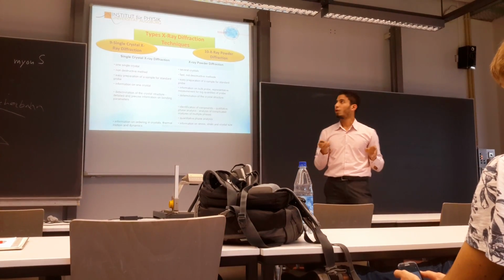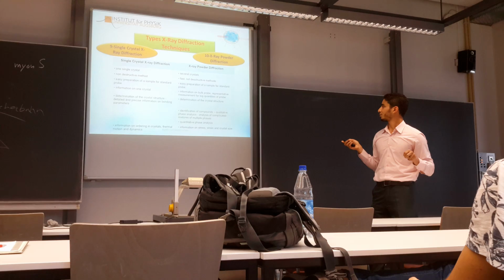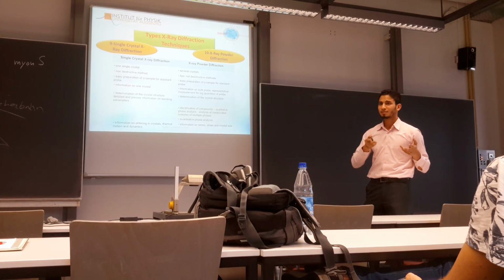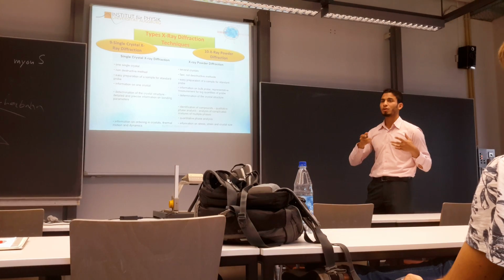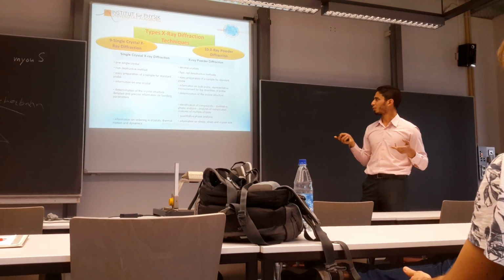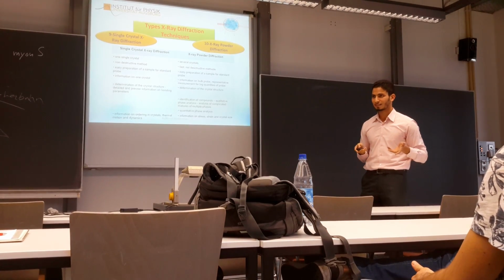Now we are going to shift to two types of X-ray diffraction techniques. There are two main types: single crystal X-ray diffraction and powder X-ray diffraction. I'm going to summarize this in just two sentences. The main advantage of powder X-ray diffraction is that it is not time consuming. You can do characterization of a sample in just 10 or 20 minutes. But single crystal, as I worked in the first semester with Professor Vorkmers in characterization of some porous material, may take a couple of days.